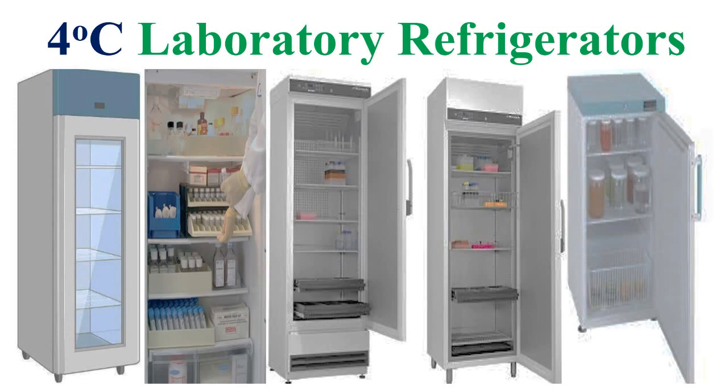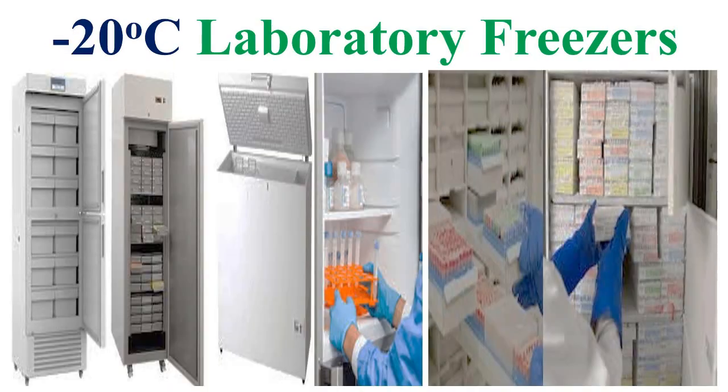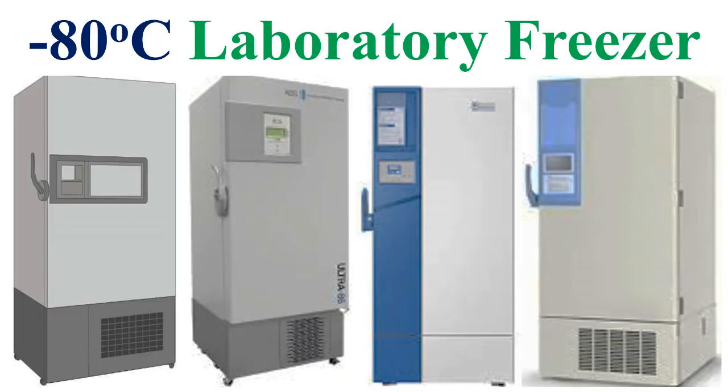This slide presents forms of 4 degrees Celsius laboratory refrigerators. And this slide presents forms of -20 degrees Celsius laboratory freezers. While this slide presents forms of -80 degrees Celsius laboratory freezers.